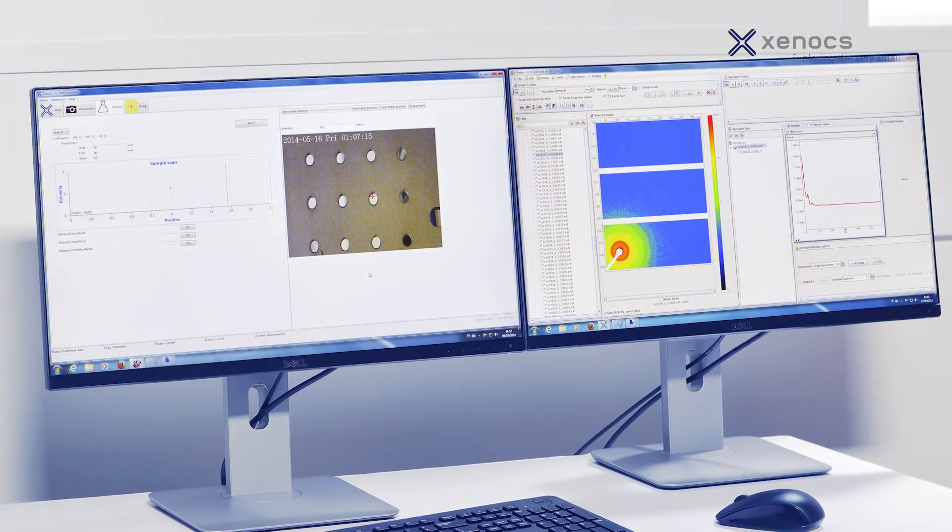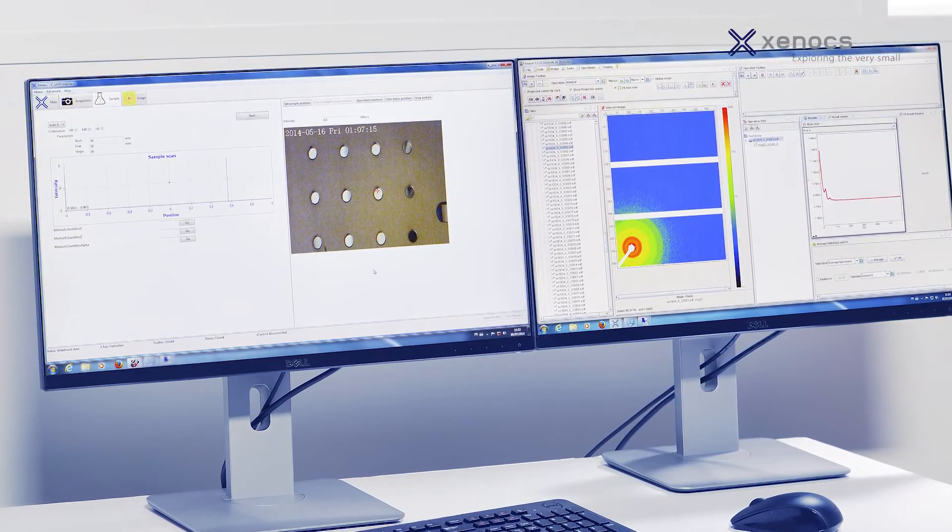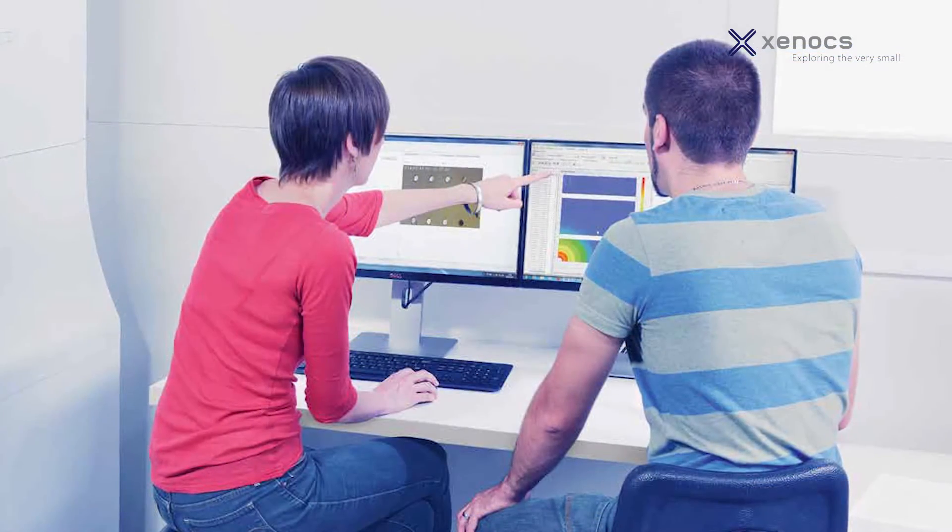A comprehensive and easy-to-use software suite for data acquisition, processing, and analysis enhances the unique performance of the NanoInsider.